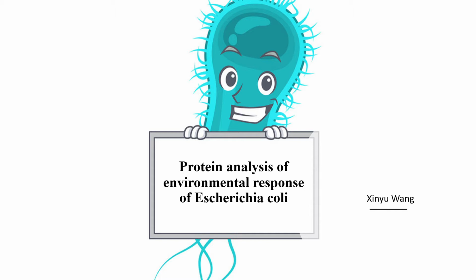So from the experiments we've performed, peptide fragments were run in the LC-MS, and the information of them needs to be identified. First of all, I'll introduce the tools that helped me get further information on protein change.